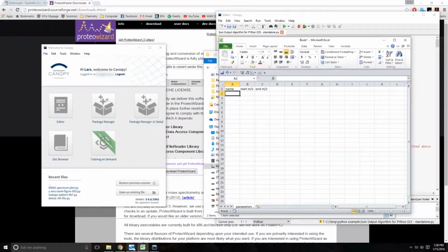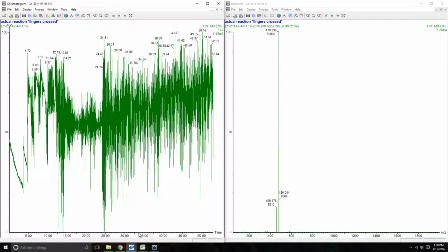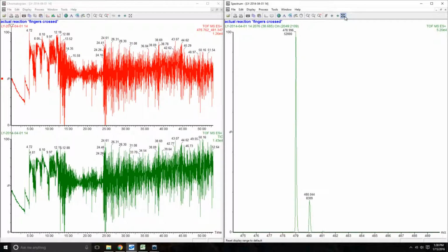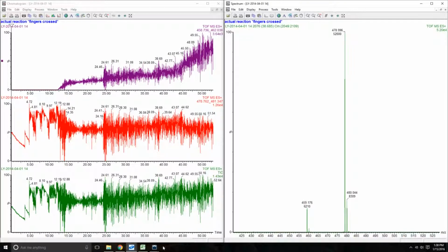What we need to do is give it the information that it wants, which is the start and end point. So I have 2 main species in this mass spectrum. Zooming in, this is my substrate. I've just summed that, and then this is my product.